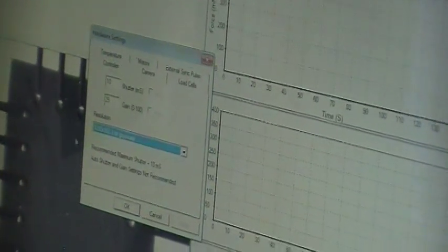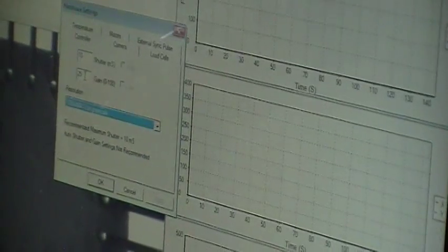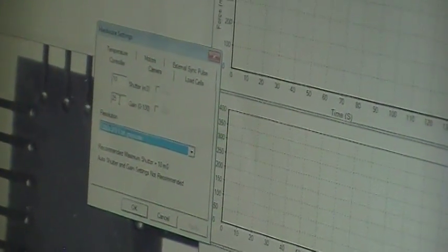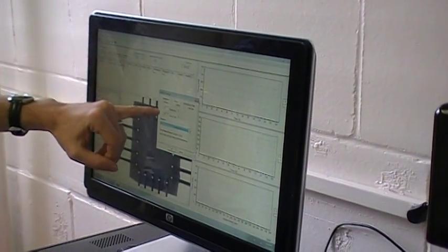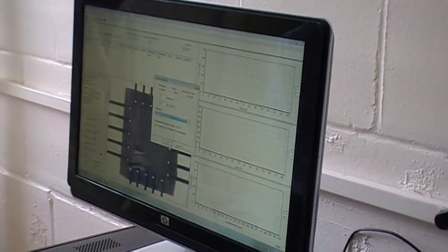Settings, camera, there's a gain here. Okay. You don't want to set shutter any higher than about 10 milliseconds. What I found most useful is to have the iris wide open, or between 75 to 100% open on the actual camera lens. Set up that now. Shutter set to 10, and then adjust the gain as needed, and that should get you where you want to go.